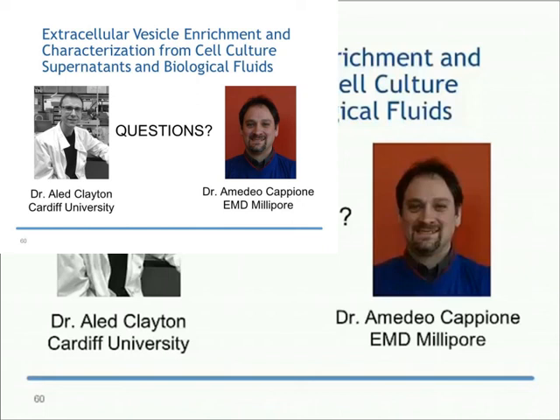If you're only needing to enrich, the Amicon Ultra method allows a very rapid way of doing this. Using the 15 mL devices, you could prep 15 mL, or in two devices, you could prep 30 mL in 45 minutes. So that's a fairly rapid way of enriching for your EV fraction in a short amount of time, and being able to work in a slightly larger volume.